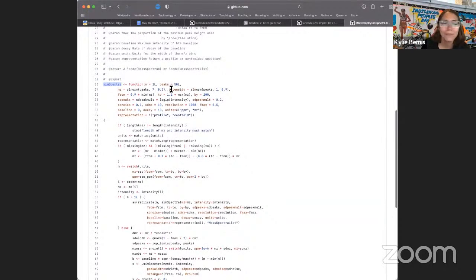Just credit me. So it generates a profile spectrum by default. You can change it to centroid if you want. Either way, it'll generate a profile spectrum. If you ask for centroid, it'll just then only take the peaks from it, I think, if I remember how I implemented it correctly. But anyway, it starts with profile data.